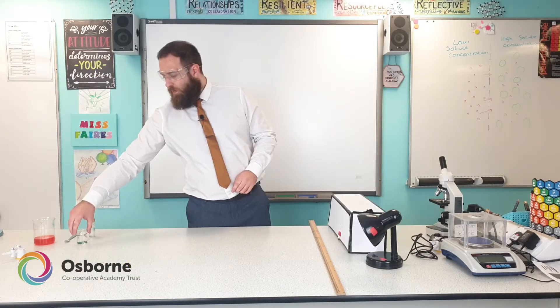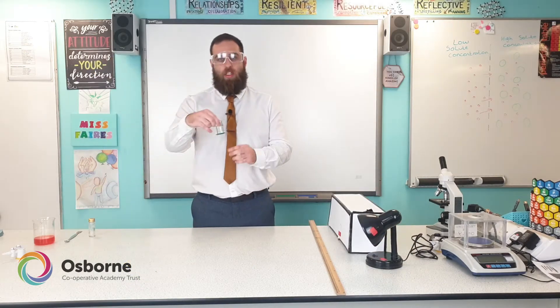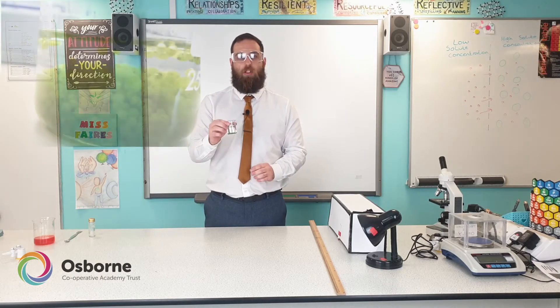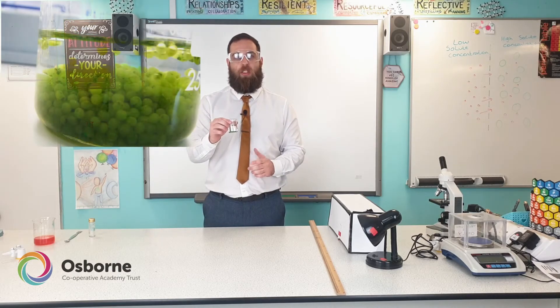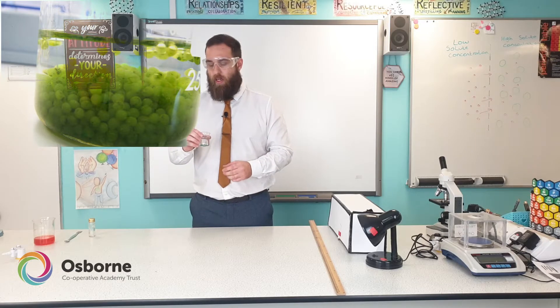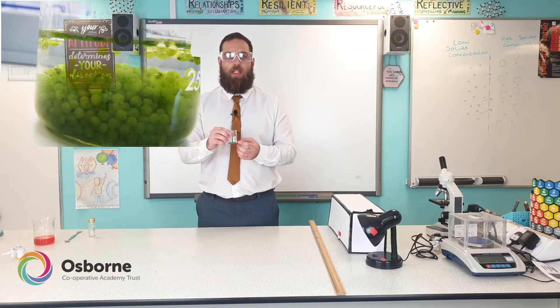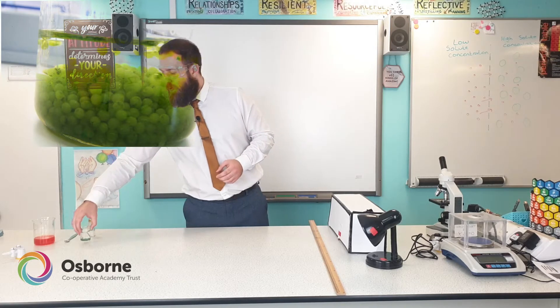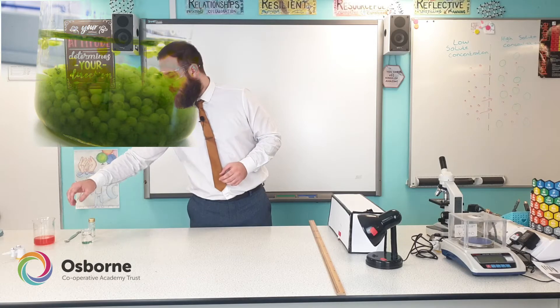First of all we're going to start with the algal balls. These are microscopic cells which contain chloroplasts, so they can photosynthesize the same as a plant leaf cell can. They're also contained in jelly to allow them to sit in the water.